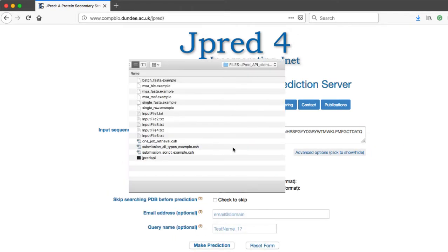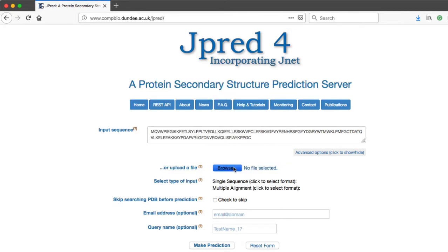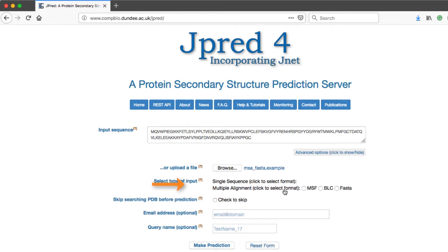Click on the browse button to upload the file. Files such as raw or FASTA files can be uploaded. For more information, view the tooltip. In the select type of input section, select multiple alignment then define the file type. In this case, the FASTA option is selected.